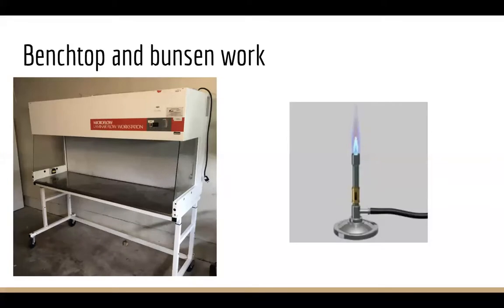One way of doing this is the classic way of the Bunsen burner. The Bunsen burner produces heat, and basically it sucks up air around it and then pushes it outwards above.